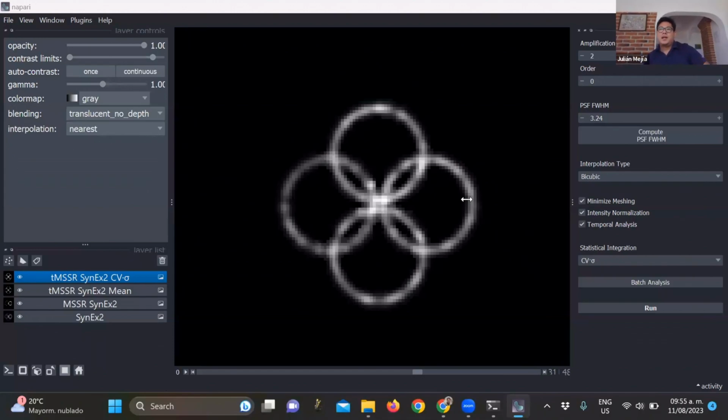Yes, of course. Actually, the question is, have you ever compared these super resolution plugins with Airyscan processing? Yes, I think that I'm ready to spoil this, Rocco. I think that you don't want to disclose this too soon, but I think we are in confidence.